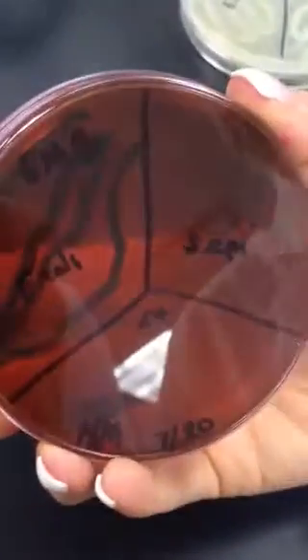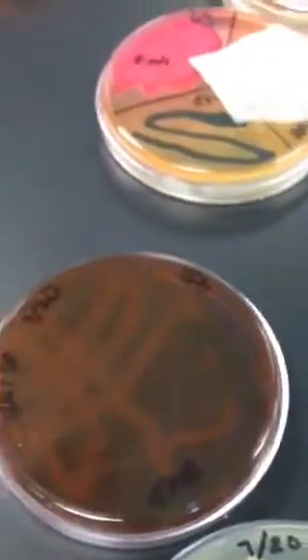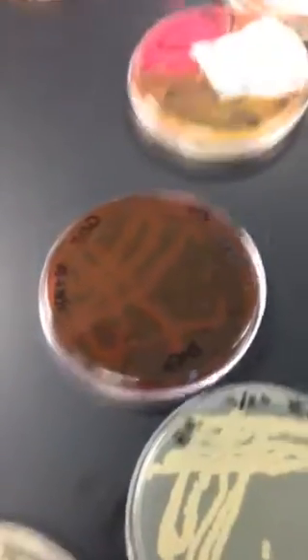When E. coli grows, it's selected for gram-negative enteric, so E. coli will grow. But when E. coli grows, it's going to be differentiated from other gram-negative enterics because E. coli will take up the eosin and the methylene blue, and the colonies themselves will turn metallic shiny green.